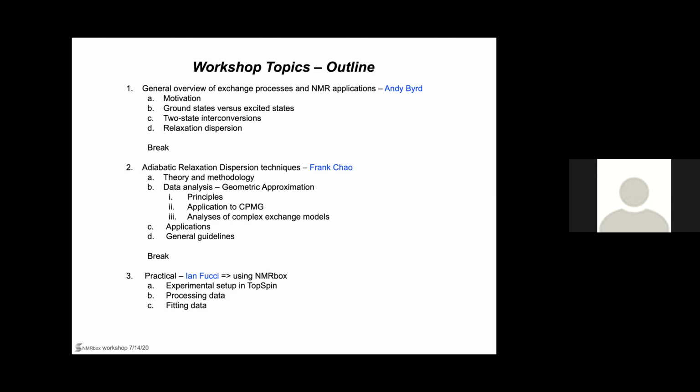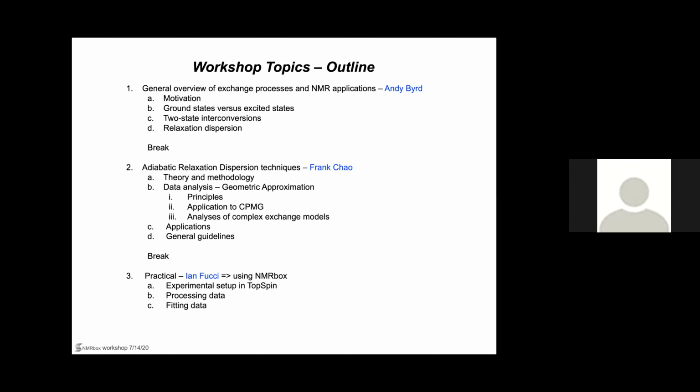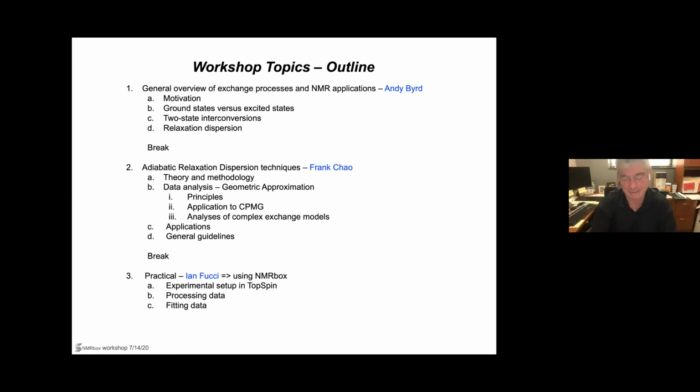He says infrequent and frequent exchange would have been a nice nomenclature we all stuck to, but like the J coupling, we are all stuck with that kind of nomenclature. We can't get out of it anymore. So yeah, I agree with you, Rajan. In fact, you get into this problem of what you call the fast exchange and slow exchange, and you get inverted. You can get wound in a knot on this when you're talking about CPMG and always that fast exchange or that slow, because now it becomes relative to your pulsing rate.